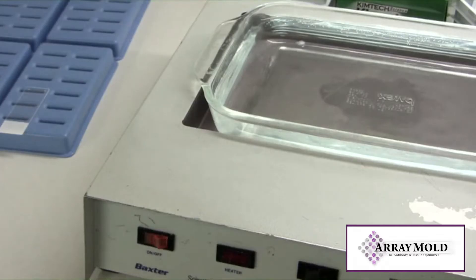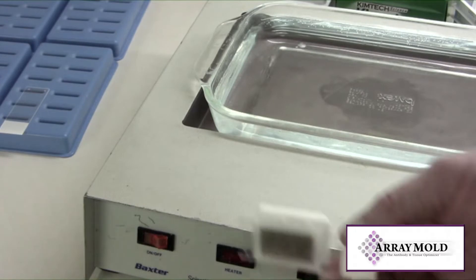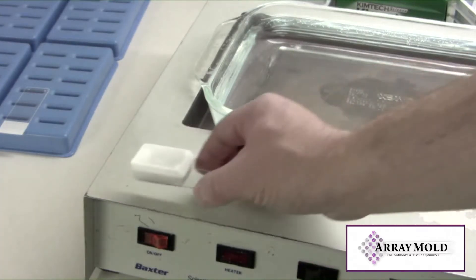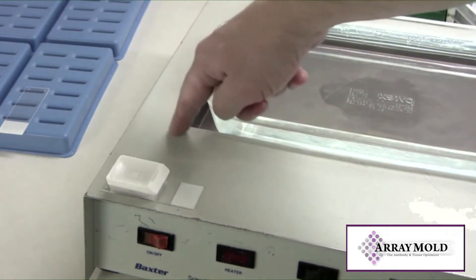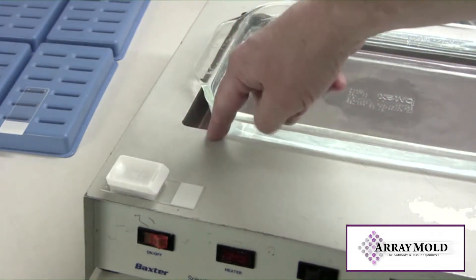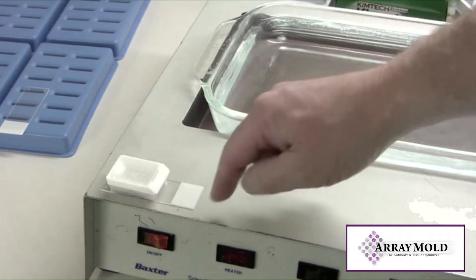Since I only have one oven, the array block still needs to stay warm and soft while this single slide heats up. I'm placing my array block on the side of my water bath. It's warm enough to keep the block soft while the single slide is heating up.